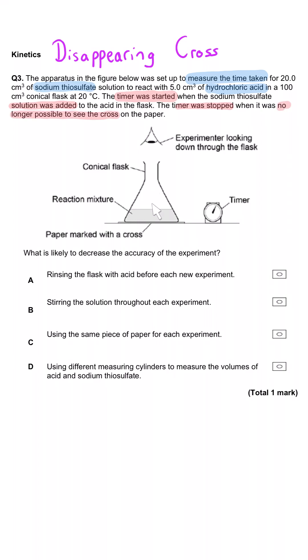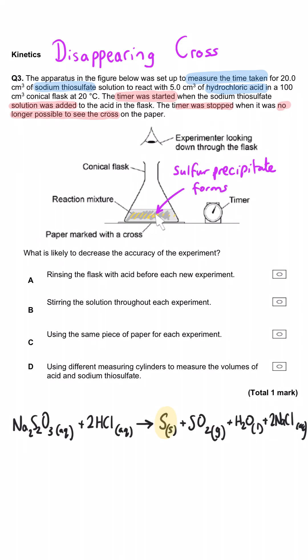You can see here is the experimenter looking down through the conical flask at where the cross was marked on a piece of paper. The reaction mixture is in here. This is a reaction that produces a precipitate of sulfur and that obscures the cross, so it doesn't really disappear but we can't see it.